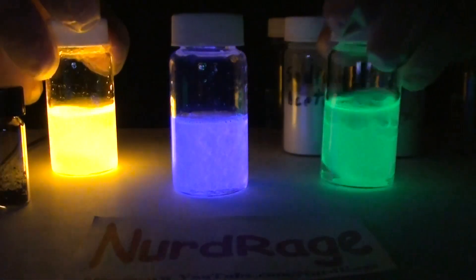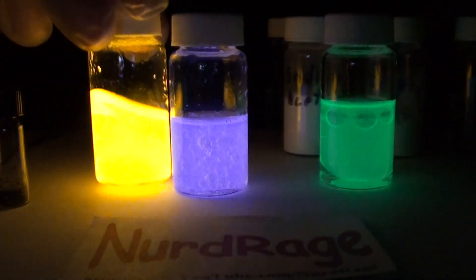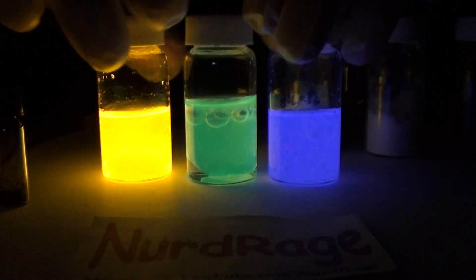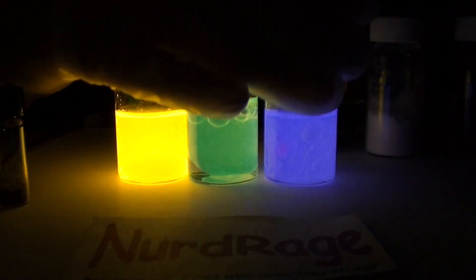As you can see the yellow one with the rubrene dye is still the brightest. A lot of people ask how long these will last, and that depends on how much of the chemicals you use and what temperature the solution is at. The amount used here at room temperature can last several hours to a day or two.